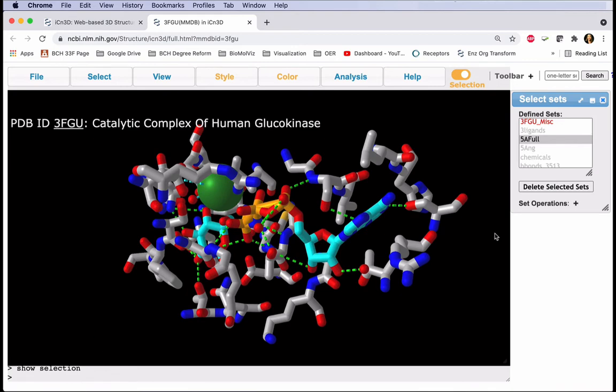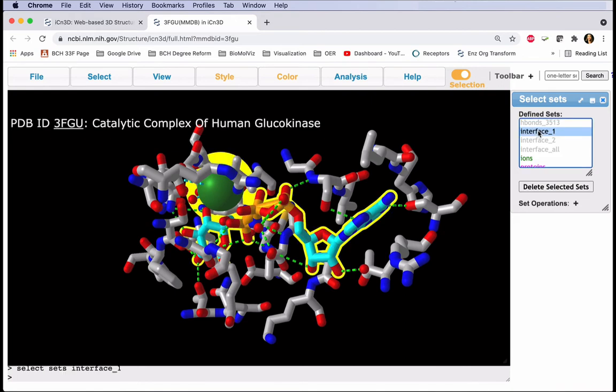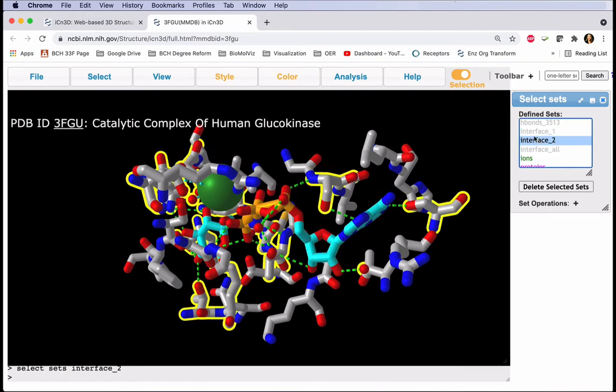When we selected the interface, that showed our hydrogen bonds, so we can select Interface 2 here, which is showing all of those hydrogen bonding residues.